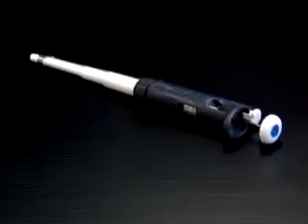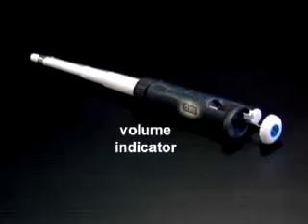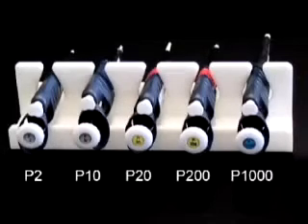A Pipetman consists of a plunger button, a tip ejector button, a volume adjustment knob, a volume indicator, and a plastic shaft. Pipetmen are available in 6 different sizes. 5 of them are depicted here. The number on the plunger button indicates the maximum volume in microliters that each Pipetman is capable of transferring. For example, the P20 has a possible volume range of 0 to 20 microliters.